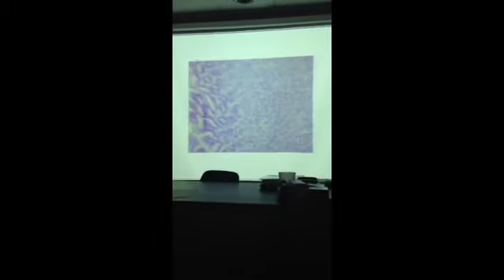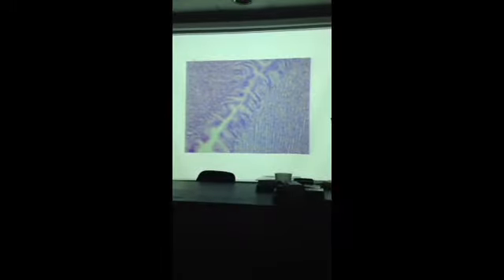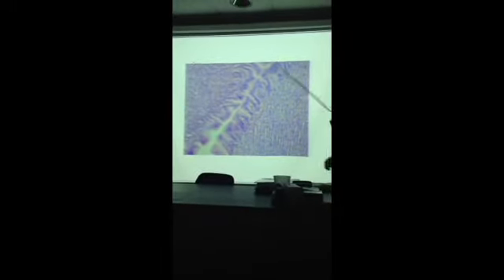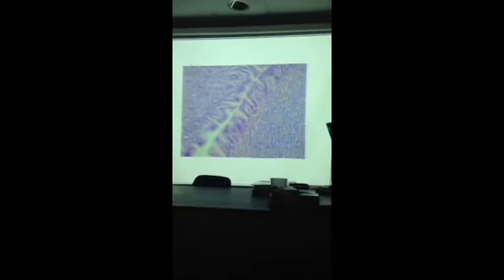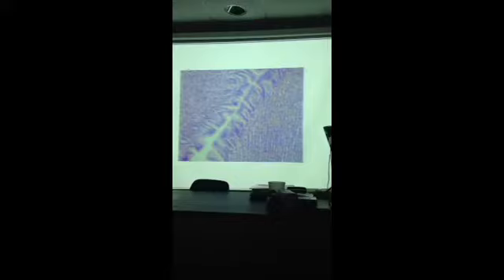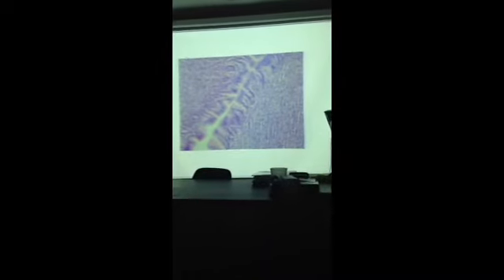But then there are some other features as well on the inside. You should be able to recognize those as well. So here again, you can see a couple of rugae here and here. And we've got these tubular indentations. What are they called? Gastric pits. All right? And they're continuous with even deeper indentations. What are these? Those are the gastric glands.